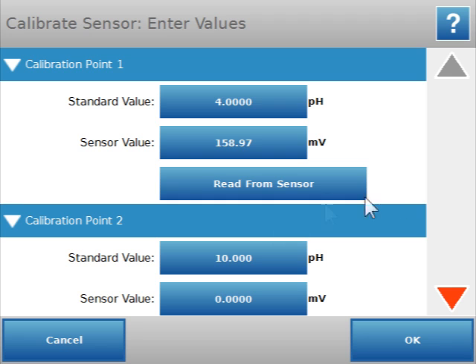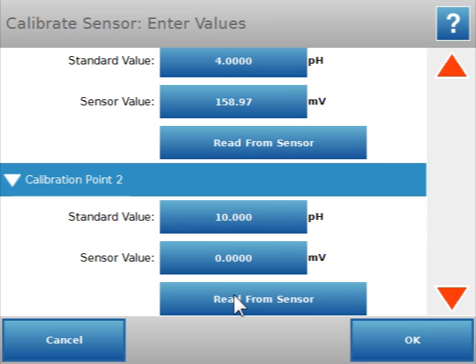I'm ready to read from that second point. I'll scroll down one and hit the read from sensor button. Now it will associate that value with a pH of 10.